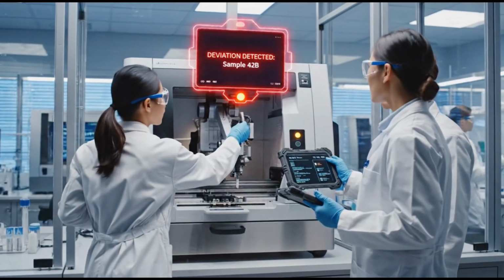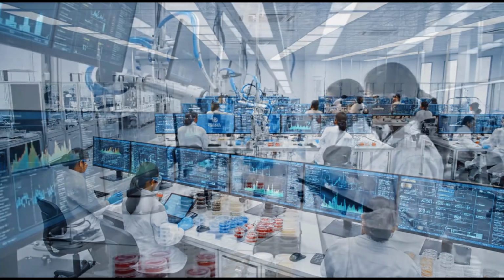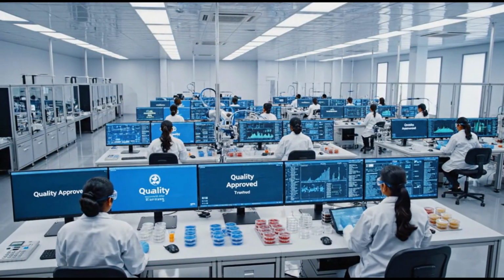Deviation detected on sector gamma. Check the calibration logs. Rerouting sequence now. Looks stable. Confirmed. Analysis is proceeding normally. Look at this fluctuation in the chromatography results here. It seems within the acceptable parameters, but let's rerun the control.